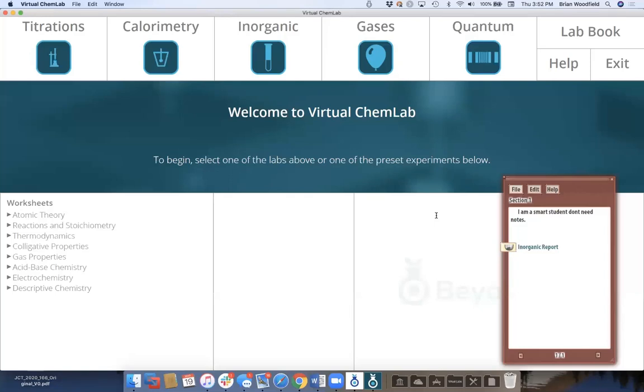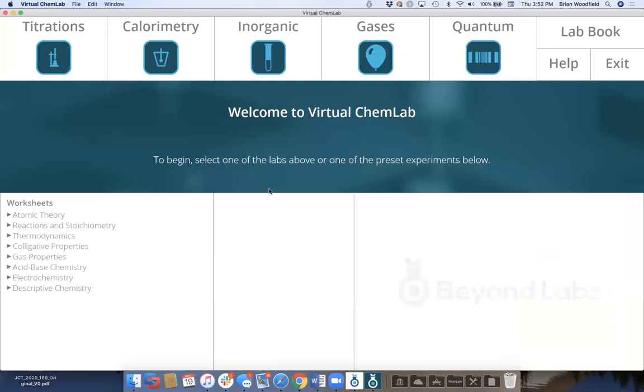And in the end, we have a couple of papers we published back in 2006 and 7, I think, that really show that it's really just doing the labs and going through and doing the assignments where the students really learn. So, all right, let's move on. So some of you wanted general chemistry, and it works the same way, okay?